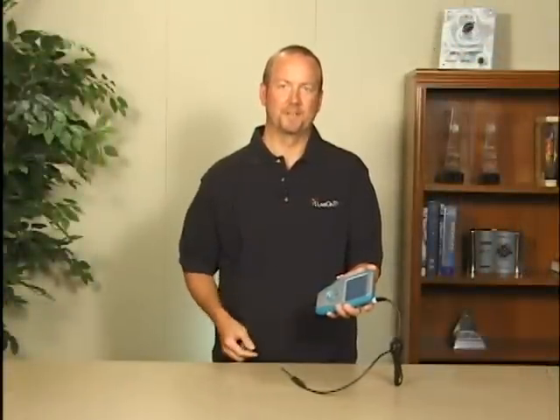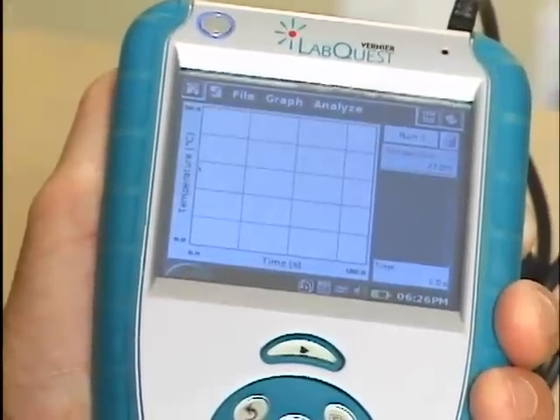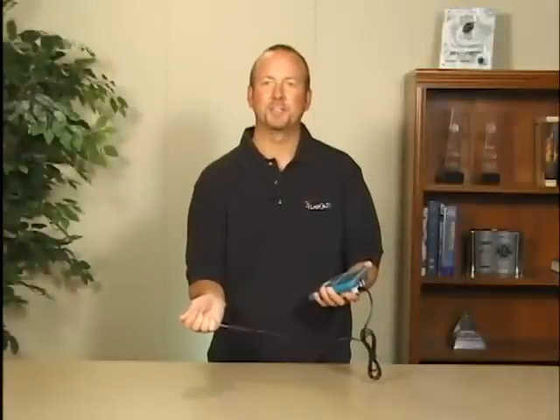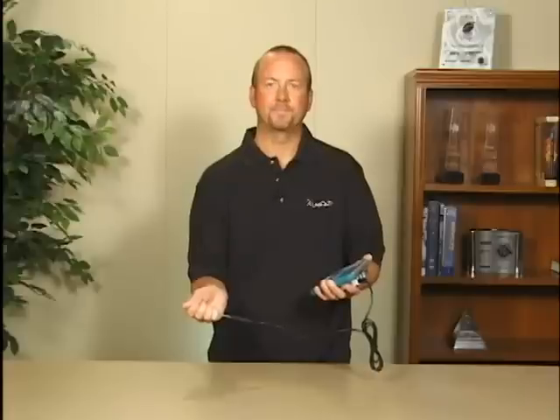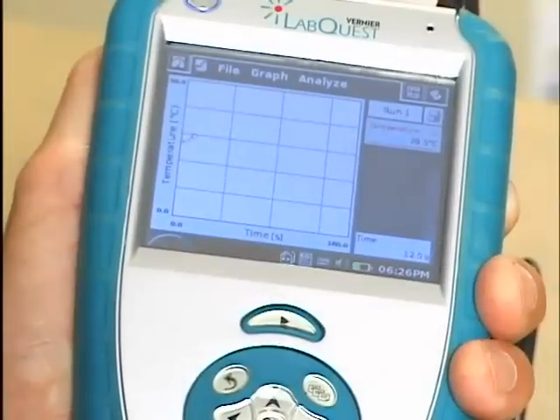All I have to do is push the collect button — you can see it's moved to a graph screen now and we're taking data. I'll put this in my hand and we'll start seeing the temperature increase as we're taking data, and we'll watch it rise for a few seconds.